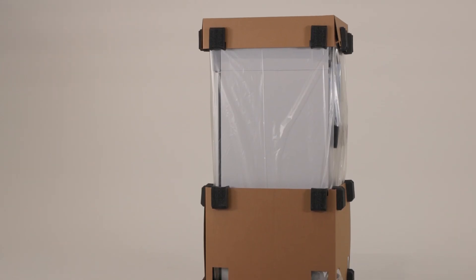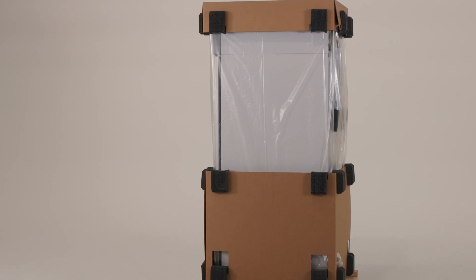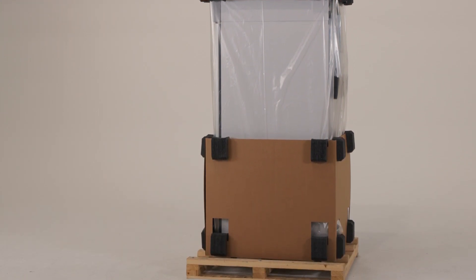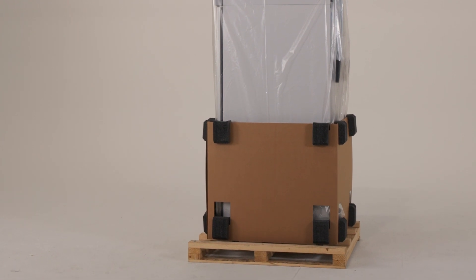carefully unpack and inspect the unit and accessories for damage. If the unit or accessories are damaged, do not discard the packing materials and immediately report the damage to the carrier.